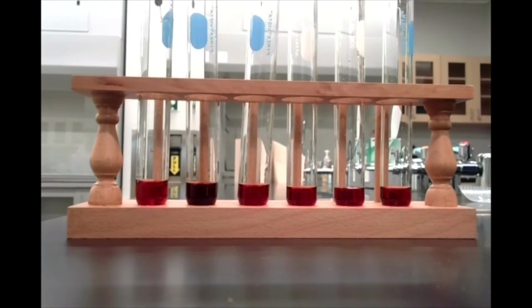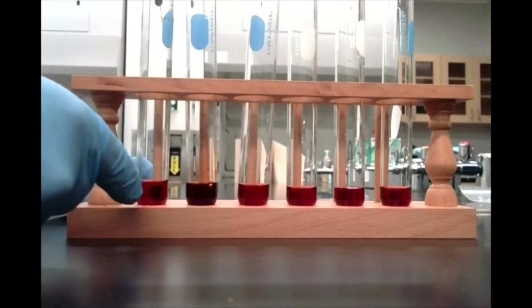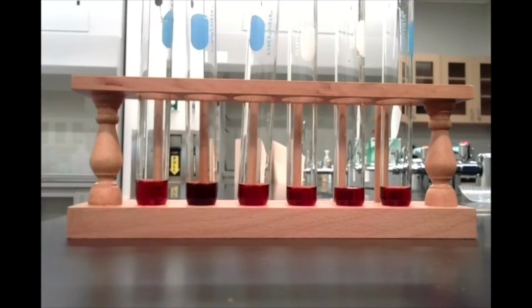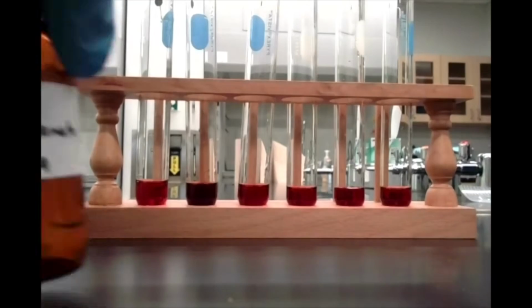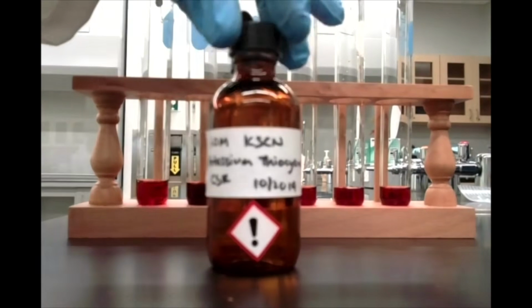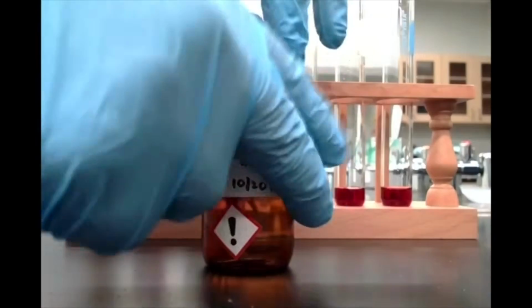Okay, so hopefully you've noticed a key difference, especially if I shake this up, there we go, it's nice and evenly mixed. You should be able to notice a key difference between test tube number 2 that we added our iron 3 nitrate ions to, and test tube number 1, which was our reference. So please make a note of that difference. Now, to test tube number 3, we're going to do something similar. We're going to add 1 molar potassium thiocyanate solution. Again, the idea here is we're adding the reactant thiocyanate. So think about how this might affect your equilibrium.